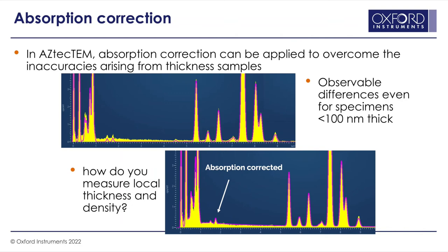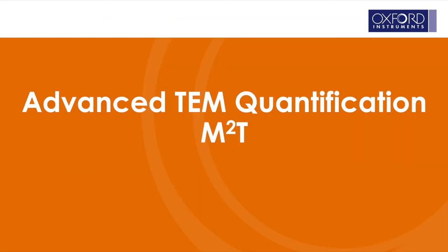However, in TEM most samples aren't completely thin. The Cliff-Lorimer approximation really applies to sub 10 nanometers, but in TEM we can be looking at samples that are about 100 nanometers. This affects quantification, as you can see here — using the Cliff-Lorimer approach to generate a theoretical spectrum, if we put a thickness of zero and don't input a density, the background isn't correct and the peaks aren't exactly at the right height. That's because your sample isn't truly electron transparent and completely thin — there will be some thickness and some density. The question is how can we measure that to get truly accurate absorption-corrected TEM quant, and that's what our M squared T advanced TEM quant addresses.